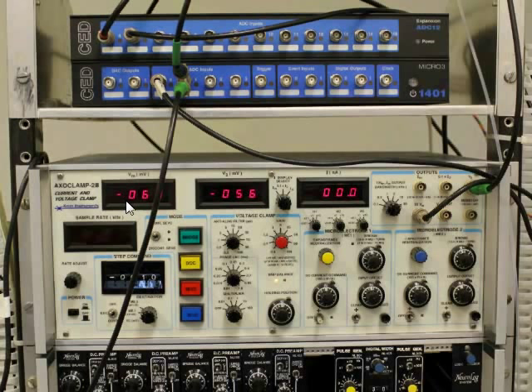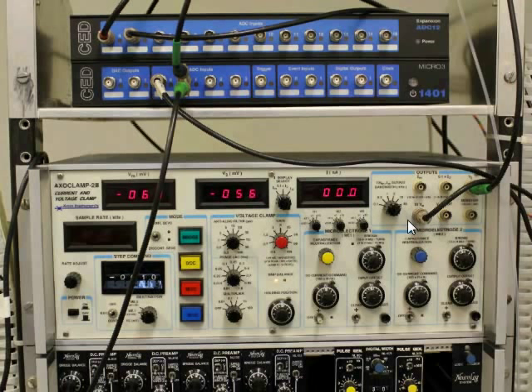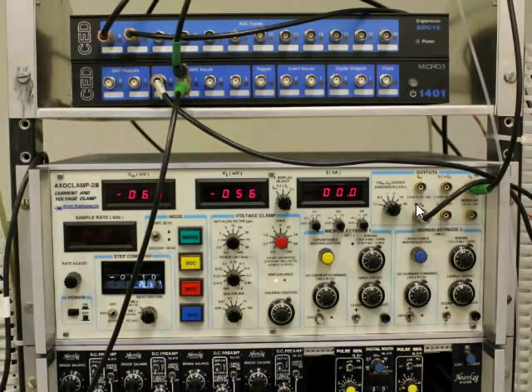We have the voltages of the two electrodes as they are measured at this point. And then we are taking these outputs, 10 times the membrane potential measured at the first head stage. Here it says 10 times Vm, it's hard to see.